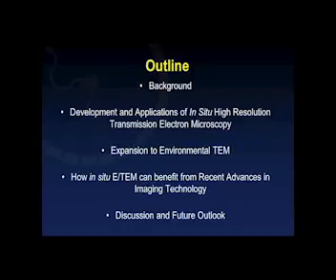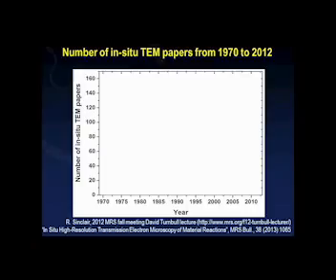The outline of my talk is as follows. First, I will start with a background on this topic. Then, I will discuss the development and applications of in-situ high-resolution transmission electron microscopy, expand into a discussion on environmental TEM. I will also highlight how in-situ environmental TEM can benefit from recent advances in imaging technology, and end with a discussion and my thoughts about what I think the future outlook might be.